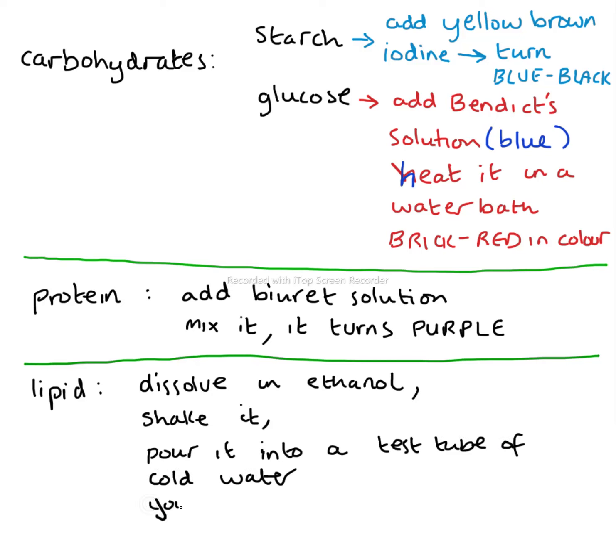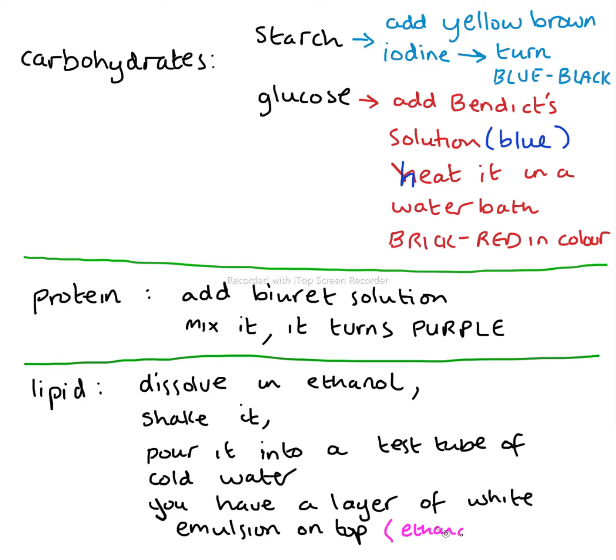You will get a layer of white emulsion or fat on the top. Now the reason that happens is because the ethanol will leave the fat and dissolve in the water.